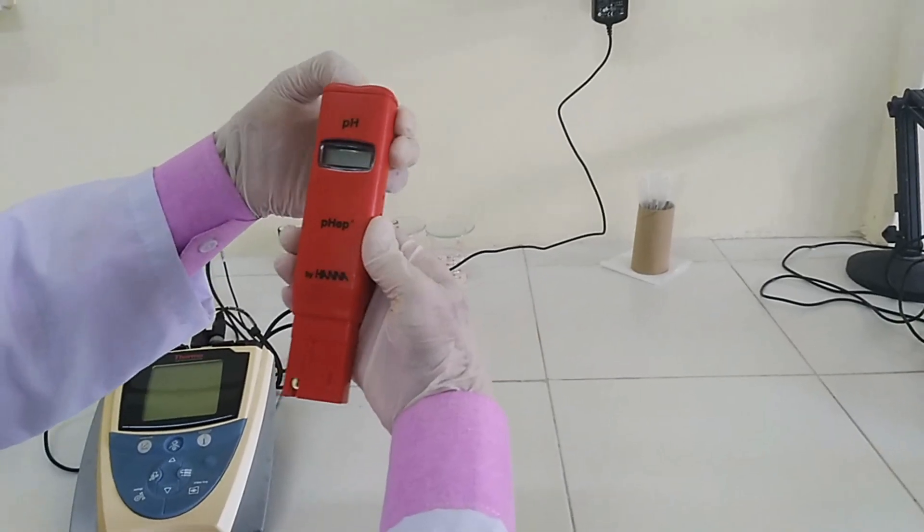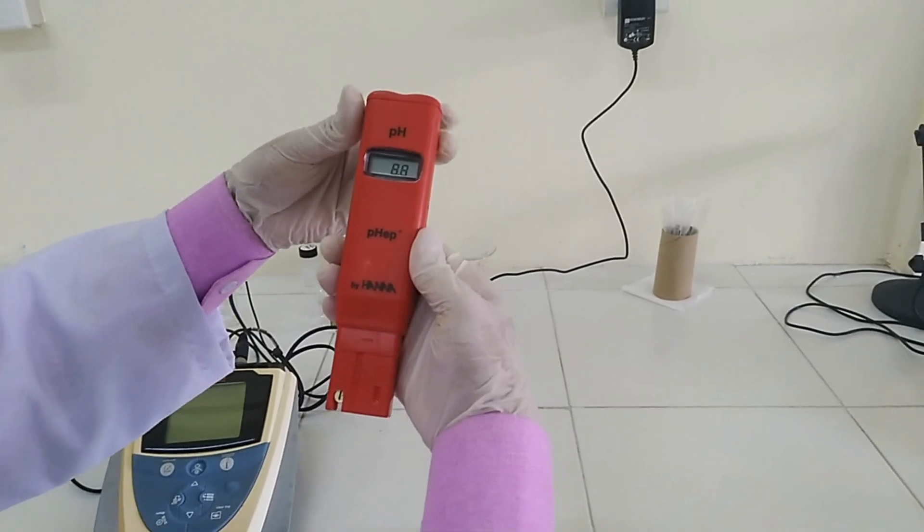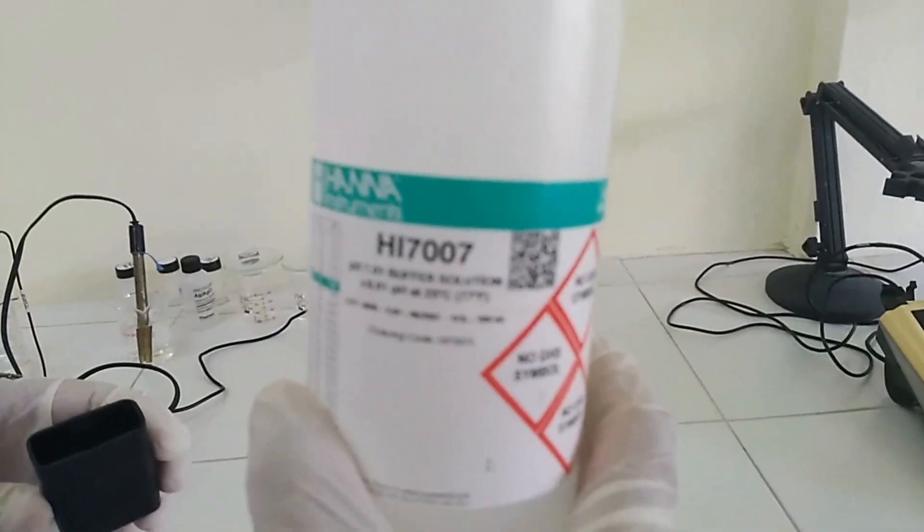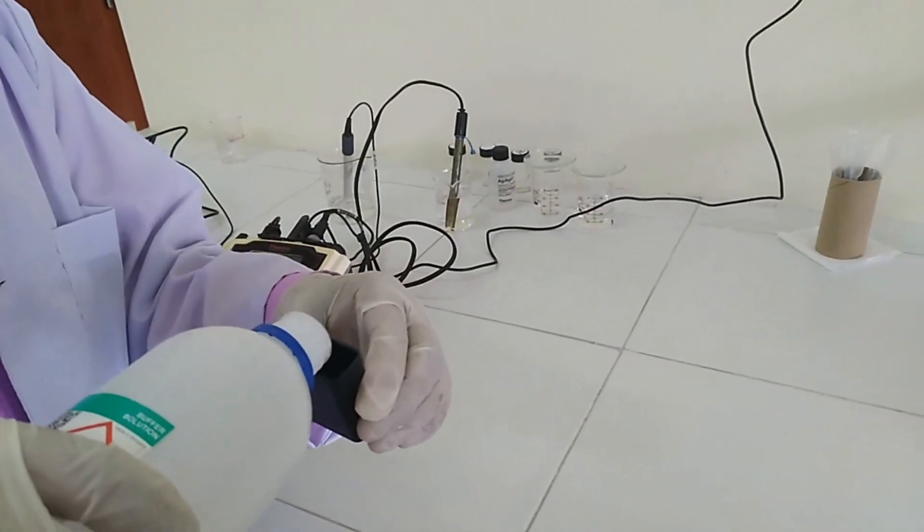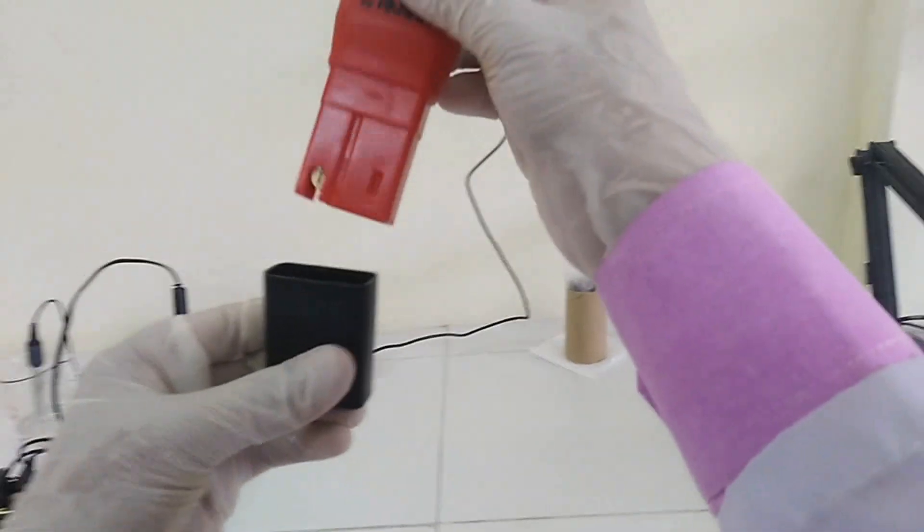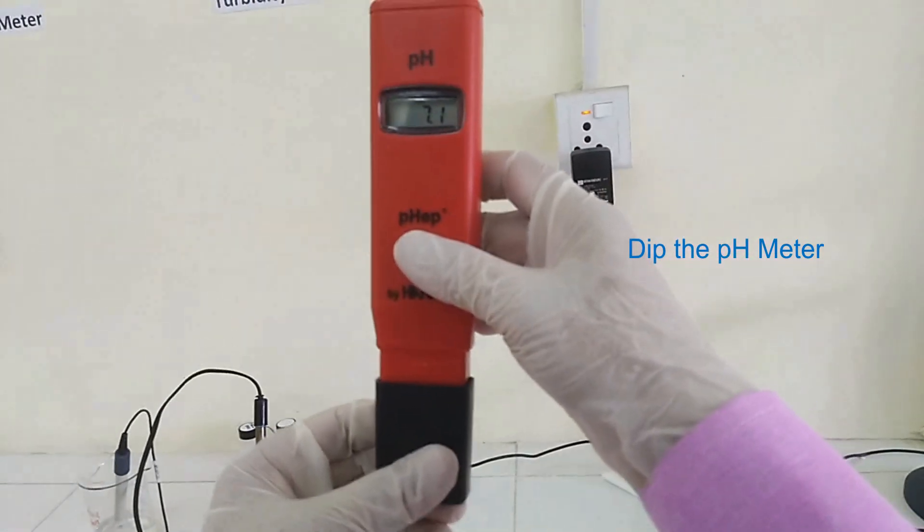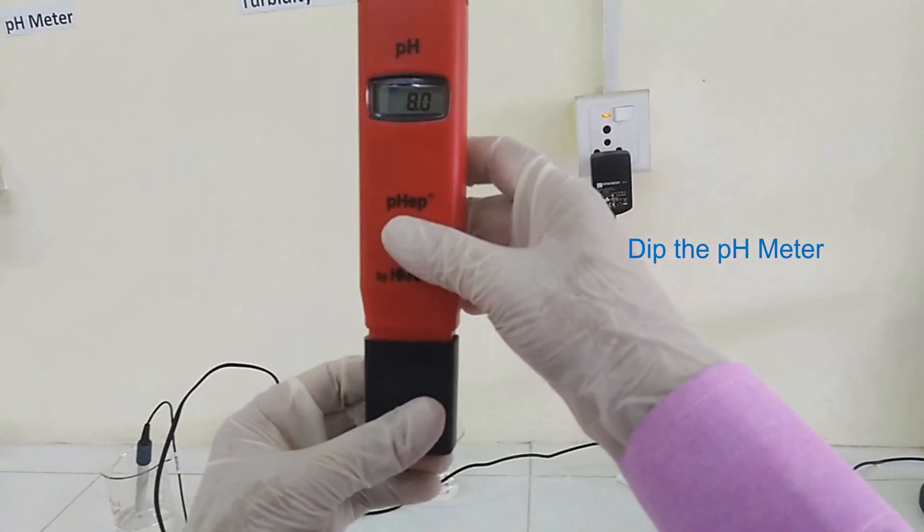Now switch on the instrument. Take buffer solution of pH 7.01 in cap and dip the pH meter.